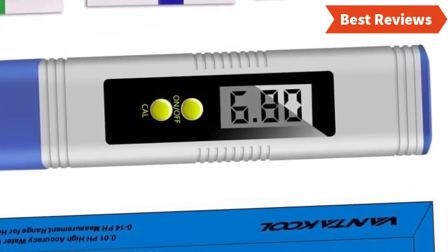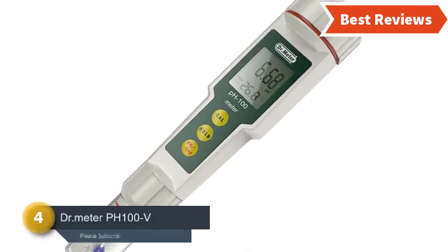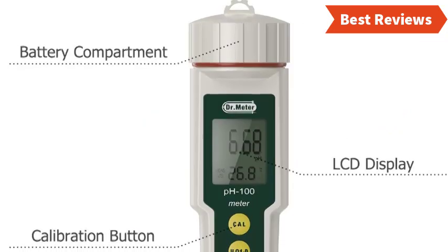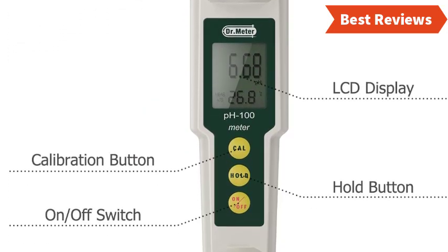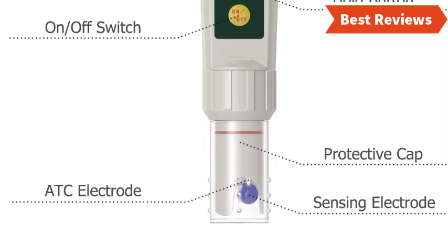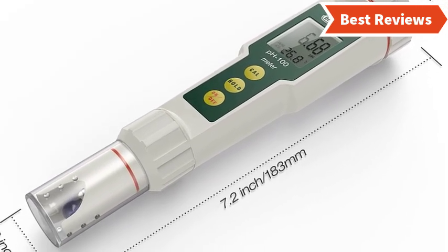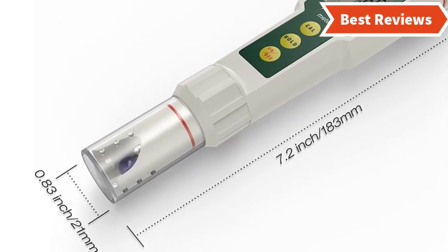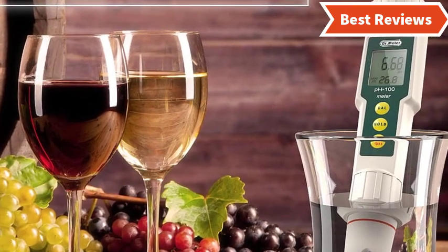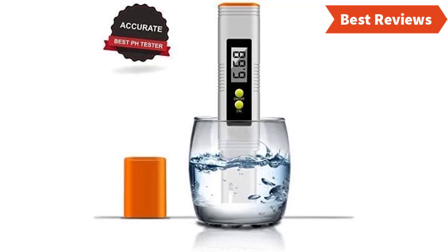Number four on our list is the Dr. Meter pH 100V. This high-accuracy pocket-size pH meter is ideal for home or lab use, with a compact and easy-to-use design — even for beginners. When used in a lab, accuracy is critical, and this 0.01 resolution pH meter delivers quick performance with convenient pH value reading and automatic temperature compensation. It can also measure the temperature of the substance. Uses include crop production improvement, food processing, water quality testing, medical research, cosmetic evaluation, and soil treatment.